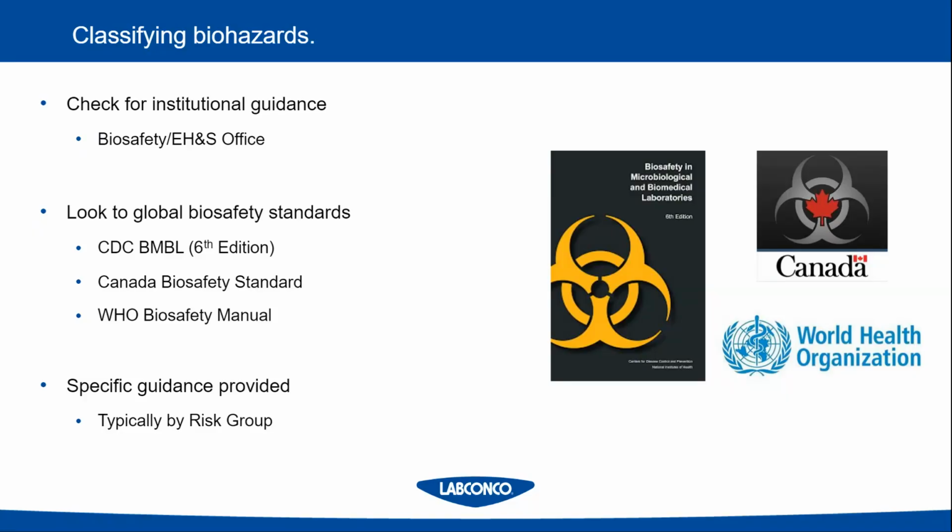So we always say on the biosafety cabinet, wait for the airflow to stabilize. And Labconco biosafety cabinets have a very clear indicator of when the airflow is stable and safe. And always use the biosafety cabinet with the correct height sash. Never have the sash open too high or too low.